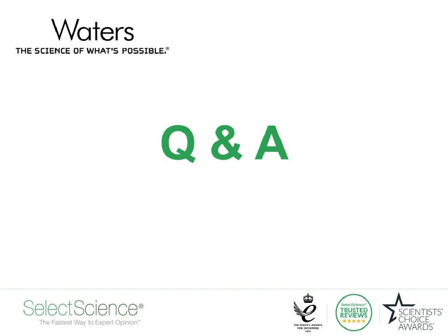All right. Our next question is, in case the sample is crude in nature, like multiple unknown organisms all in one contaminated site, is it possible to study them using DESI-MS? I'm sorry.